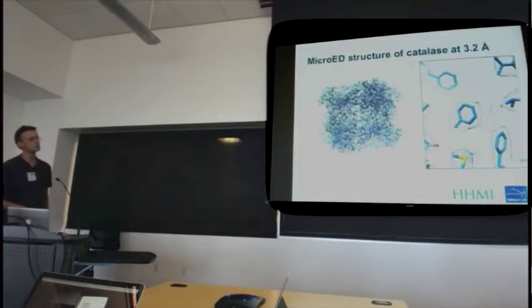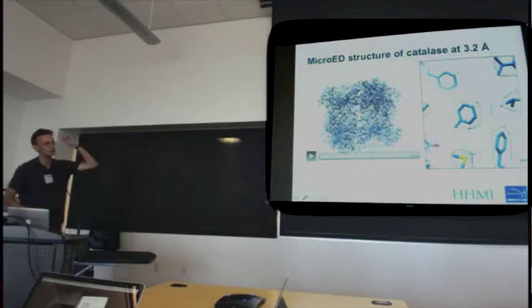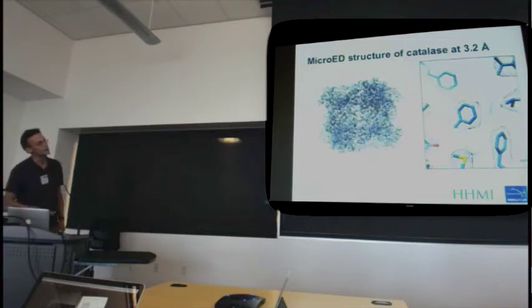Right, so it works, is what this slide says. We recently went beyond lysozyme and looked at catalase, which has a long history in electron diffraction. We were able to solve the structure of catalase to 3.2 angstrom, phased by molecular replacement. The density looks good.